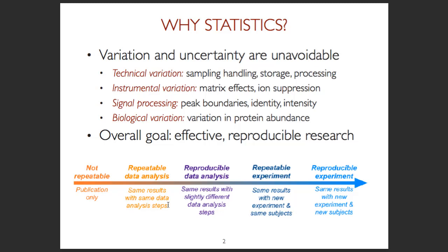And so the spectrum here varies from repeatable data analysis, where we have the same data and an analysis which is, let's say, published or somehow documented. And we want to make sure that we take this data, we take the workflow, and we can repeat step by step everything to generate the same figures, the same numbers. And that by itself is quite challenging, especially with tools such as Excel or other tools such as Skyline or others which have a lot of human intervention, a lot of point and click. That by itself is challenging. And I can even say from our own experience, if the data analysis workflow is not entirely automated, it is very difficult to even take the same input data and get the same figure, the same summary.